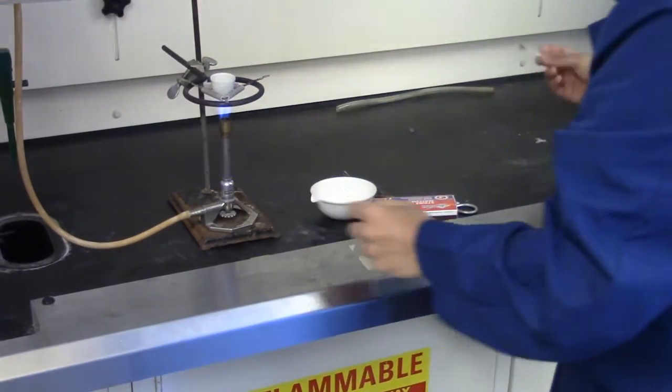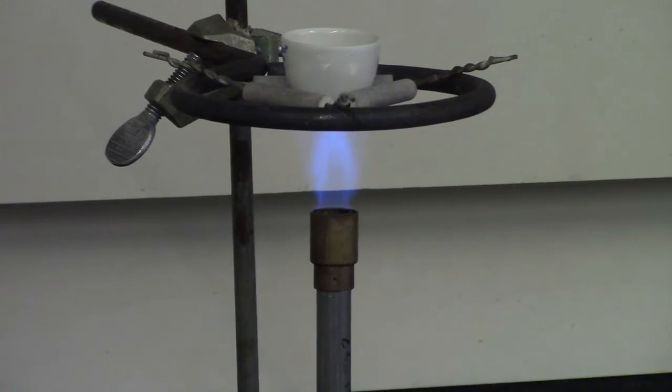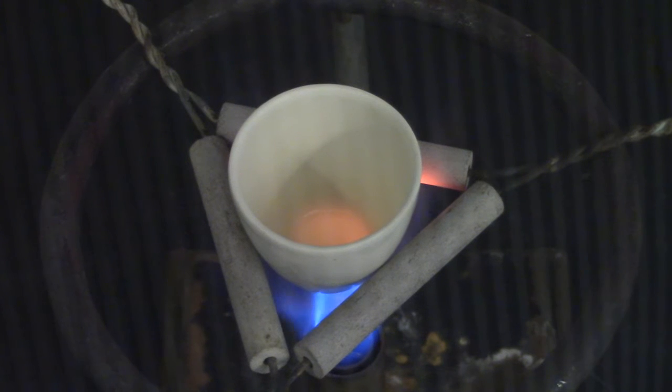Adjust the burner to a very hot flame. The tip of the inner cone of the flame should touch the bottom of your crucible. Once the bottom of the crucible turns red-orange, heat for 2 more minutes.